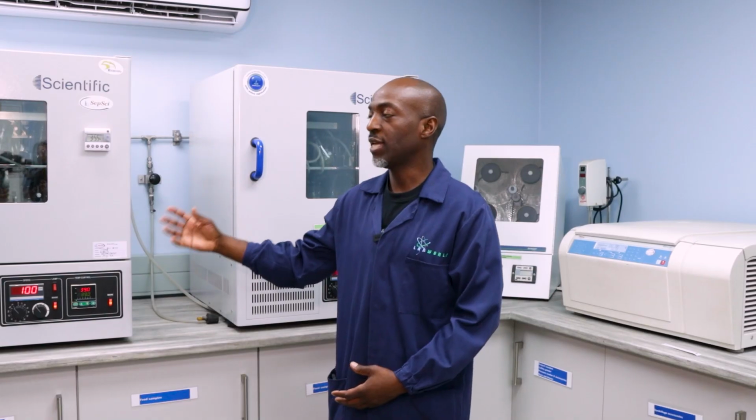This is where we usually develop new methods, but for now I'm just going to explain the digestibility experiments that we conduct. So we conduct starch digestibility, protein digestibility, and fiber digestibility using these two incubators.